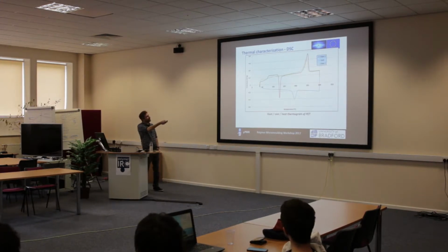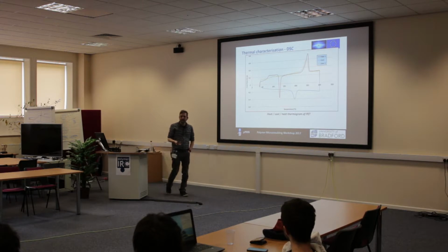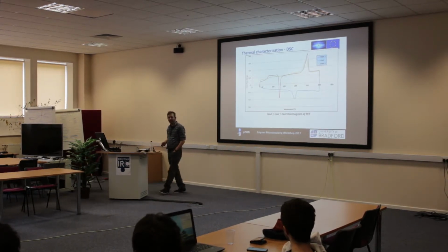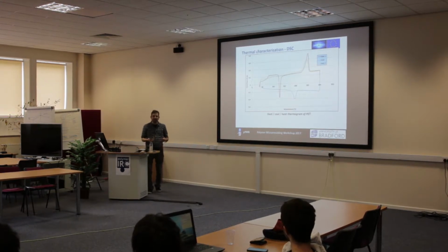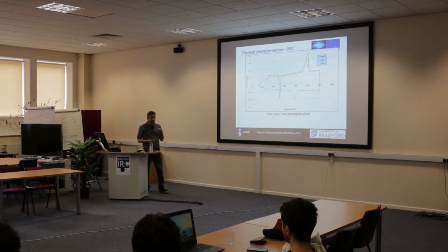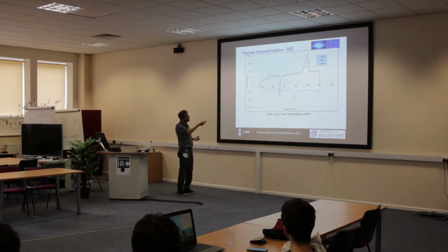Okay, so here's our melting endotherm over here. And yet here we've got an exotherm. So what's occurring there? What can be happening with our material that's actually the opposite of melting? What's happening is the material is starting to cold crystallize, okay? It's starting to form additional crystals at this temperature.